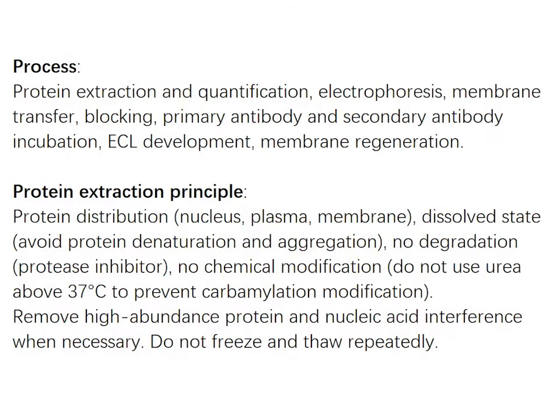There are several steps in the process of Western blot: protein extraction and quantification, electrophoresis, membrane transfer, blocking, primary antibody and secondary antibody incubation, ECL development, and membrane regeneration.